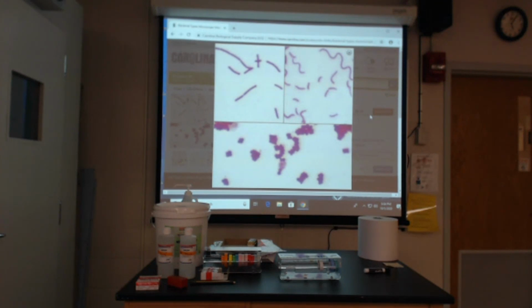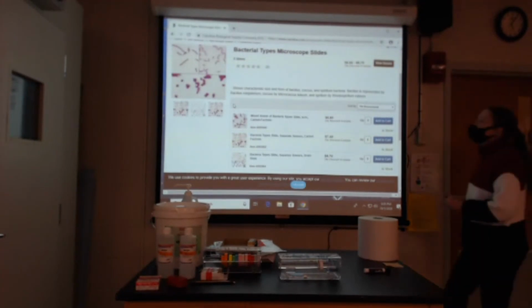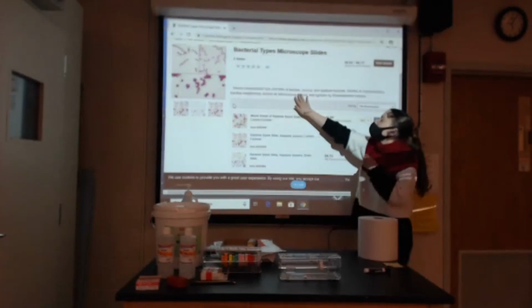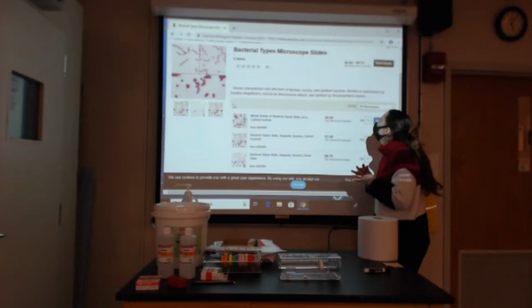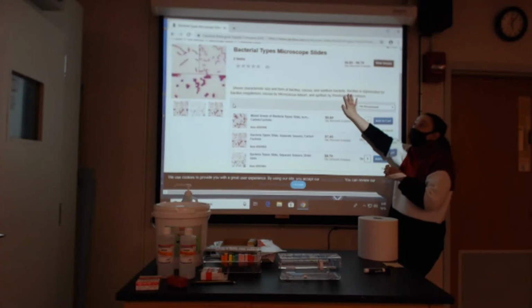And if you would like to know the names of these bacteria, the bacillus is actually going to be the Bacillus megatherium. The coccus is represented by the Micrococcus luteum, the same one that's yellow in our samples. And the spirillum is represented by the Rhodospirillum rubrum.